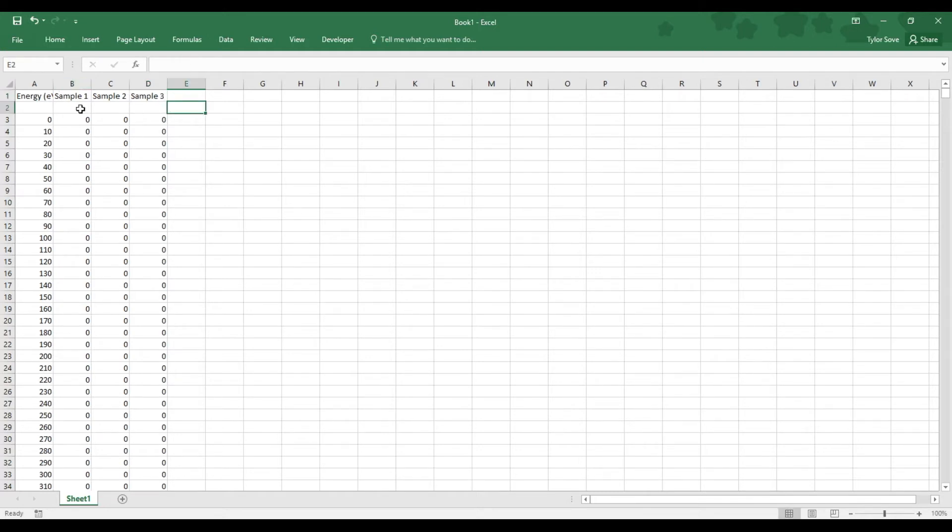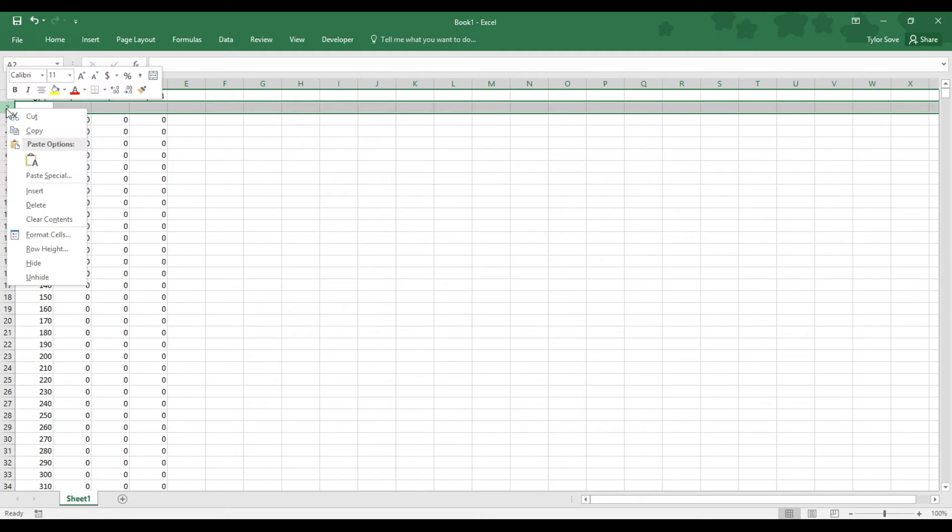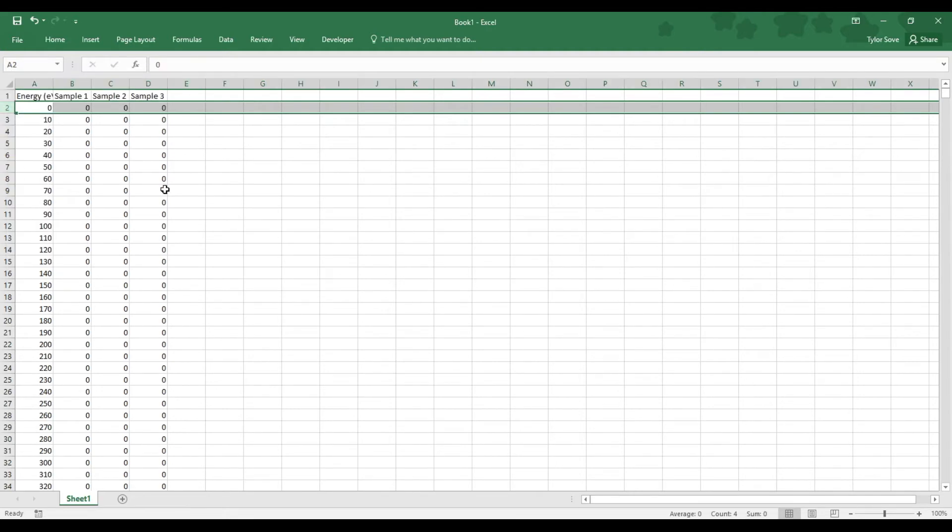So that is how we import XRF data into Excel. Now it's a matter of trimming this up just a little further. We do not need this row number two, that will just put a gap in our data. So we can delete that by selecting the row two header and selecting delete.